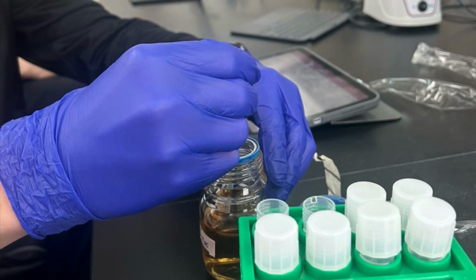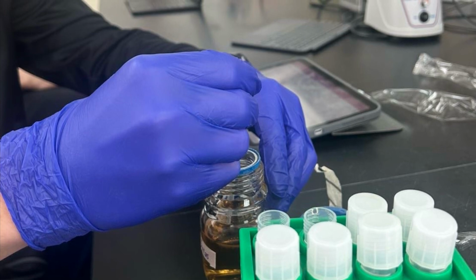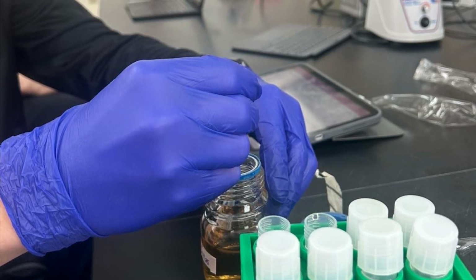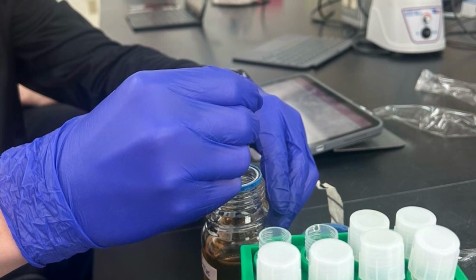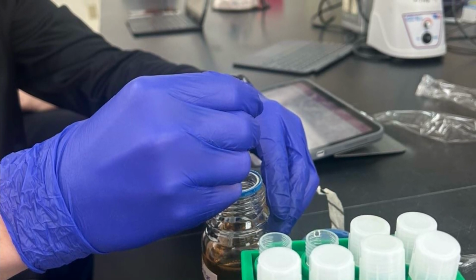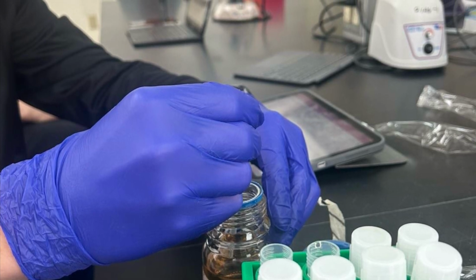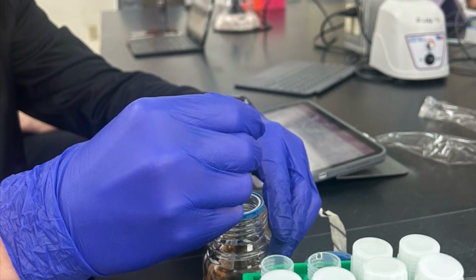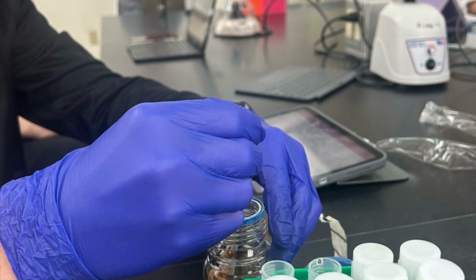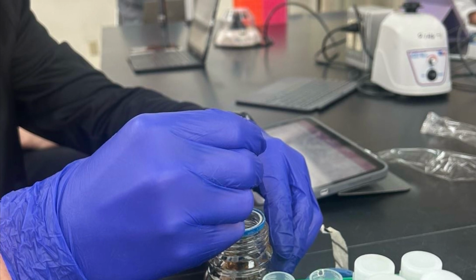In this experiment, we studied microevolution in real time by tracking how E. coli populations evolve resistance to the antibiotic ampicillin. To start off, we created a mixed population of ampicillin-resistant and ampicillin-sensitive E. coli, and then we grew the bacteria under two conditions, with and without ampicillin. Each week, we transferred a small volume of culture to fresh media while making sure to maintain selective pressure in the ampicillin-treated group.